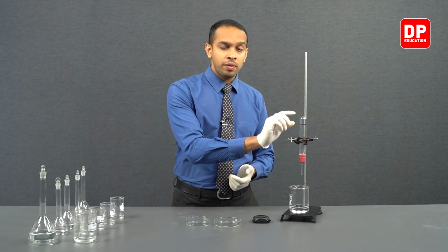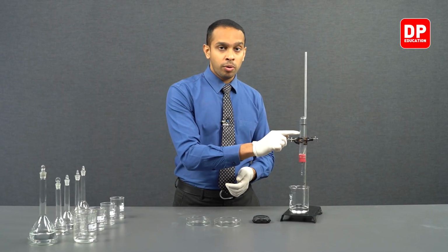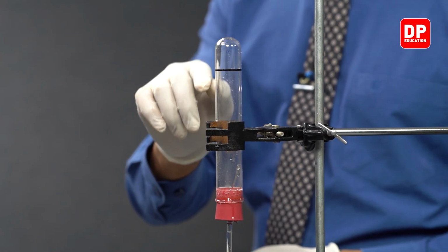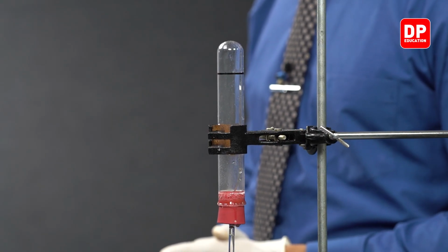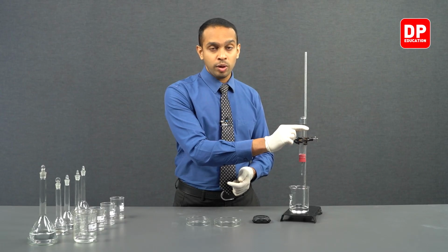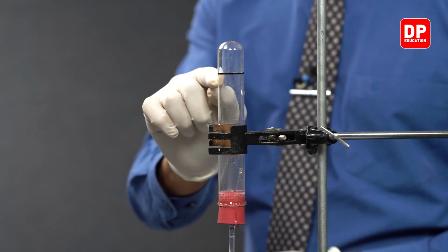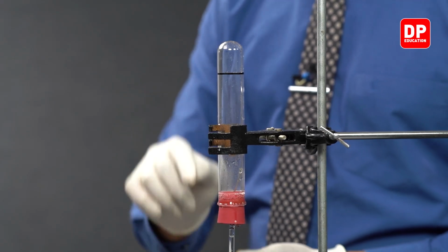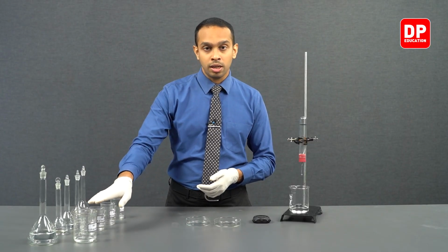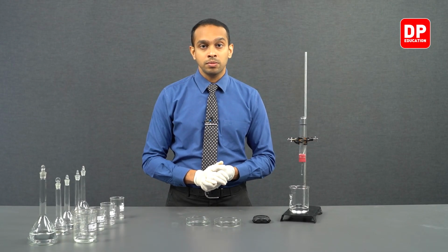So to make sure that we keep the volume of hydrogen gas that is collected a constant, we used a boiling tube and we drew a line 3 centimeters from the bottom of the boiling tube. So we measured how long it takes for each reaction to collect hydrogen gas all the way to this black color line that we have drawn on the boiling tube. And we observed, as we increase the HCl concentration, the time that it took for the hydrogen to get collected reduced.